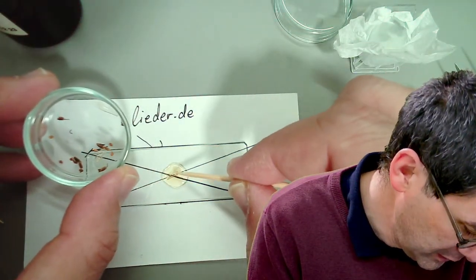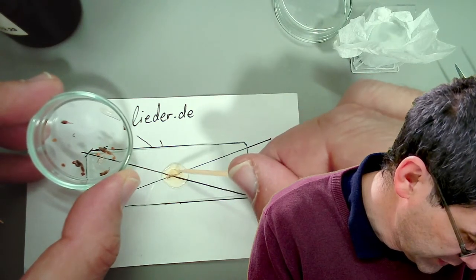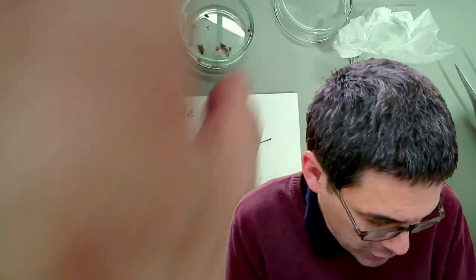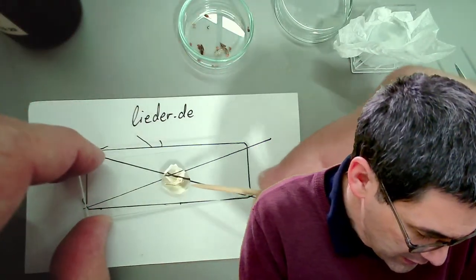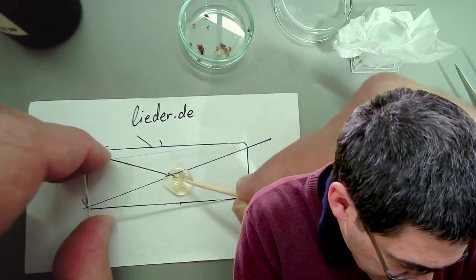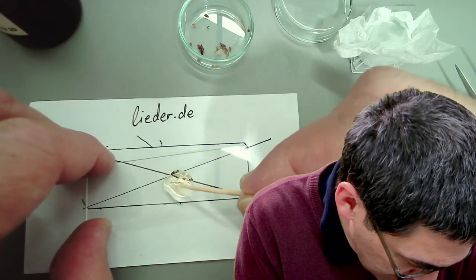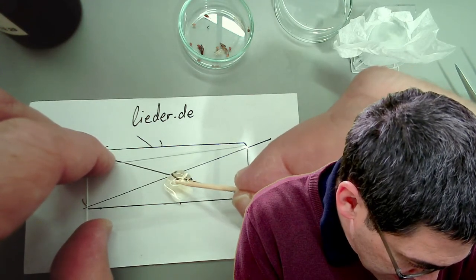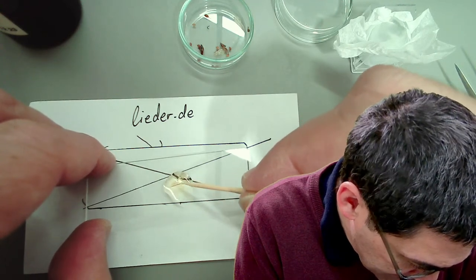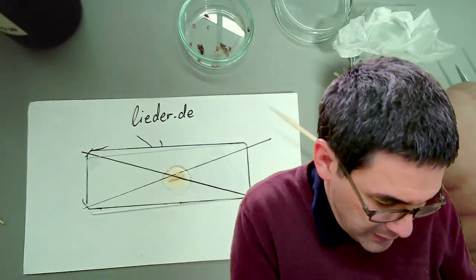Again, let's put it in here. And does it come off? Does it come off? Okay. It is already submerged. Maybe by moving it around a little bit, maybe this way I can remove some of the air bubbles. I don't know. But is it covered? It seems to be almost covered now. No. Okay. Now it's covered. Now it's completely submerged. So let's give it another try.